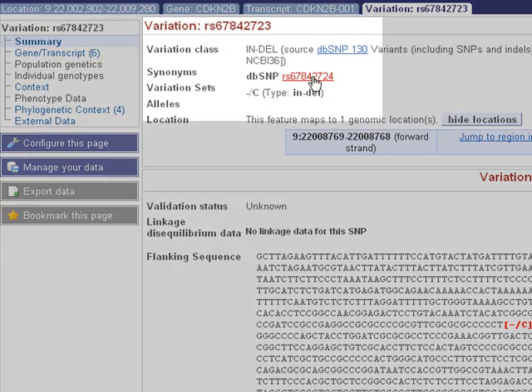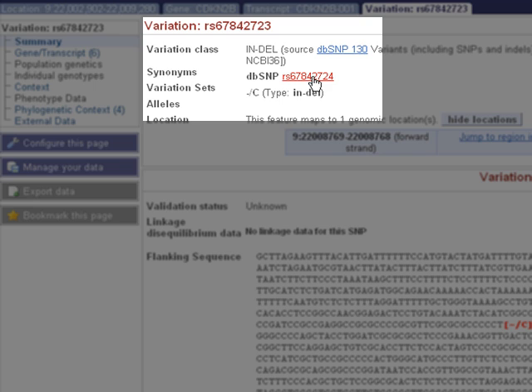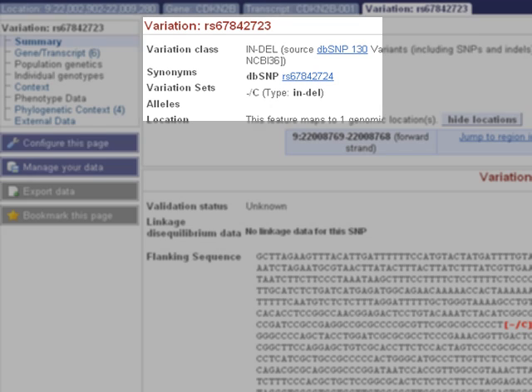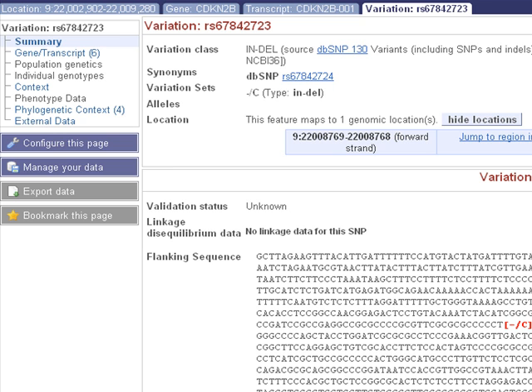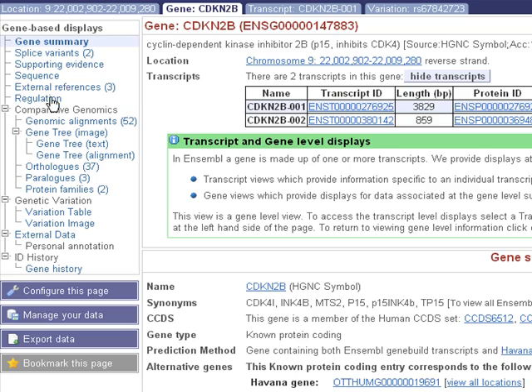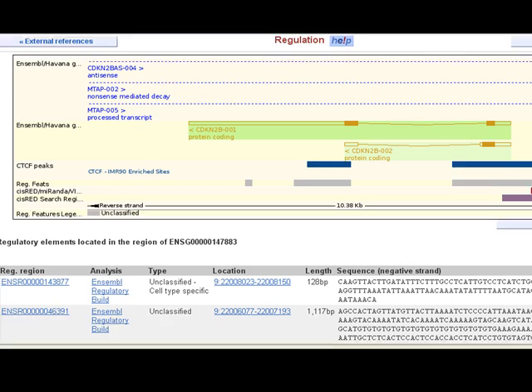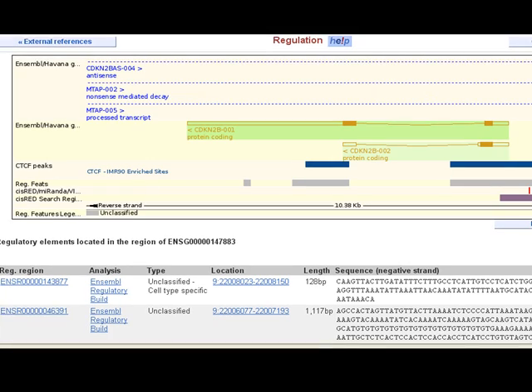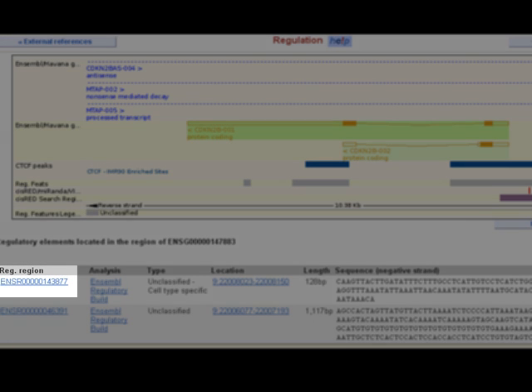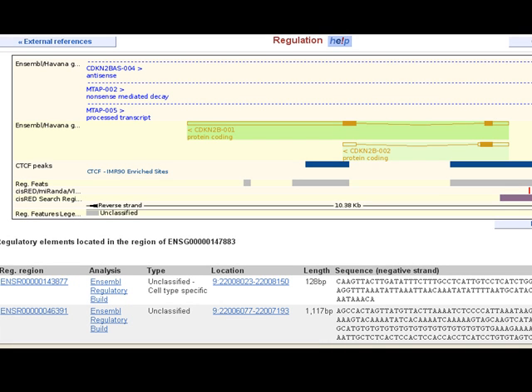Or follow the link to NCBI dbSNP to view the original submission. The fifth tab in Ensembl is the regulation tab. To find it, click the gene tab and then regulation. Here we have information from the regulatory build. These ENSR IDs represent sequences associated with open chromatin based on DNase 1 hypersensitive sites and CTCF binding sites. Click on one to open the regulation tab.